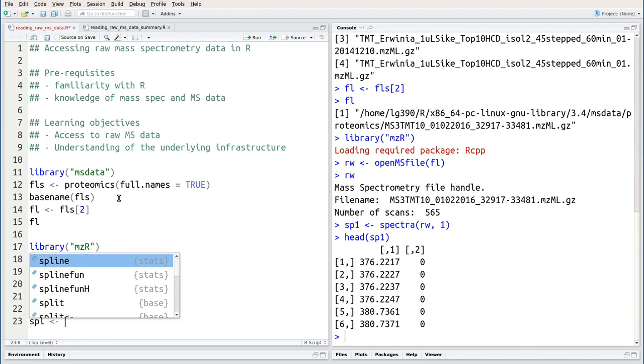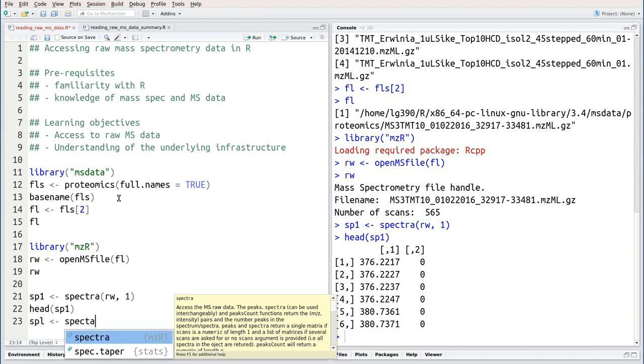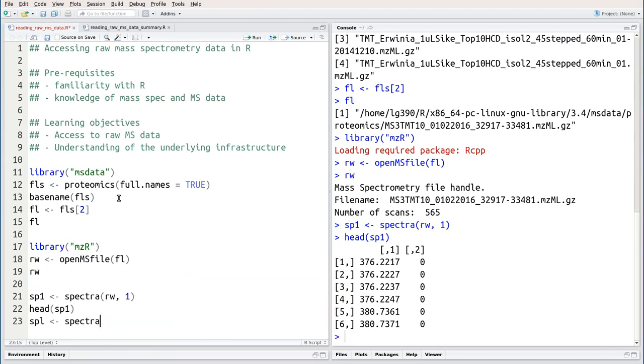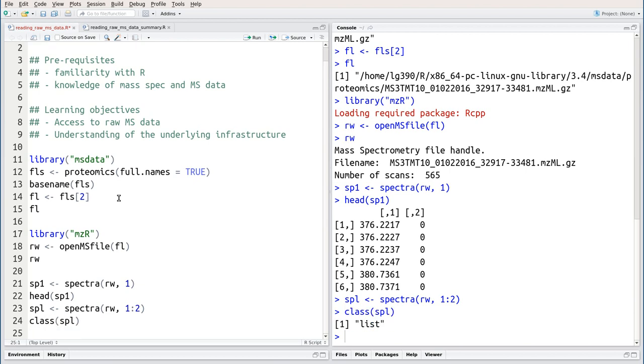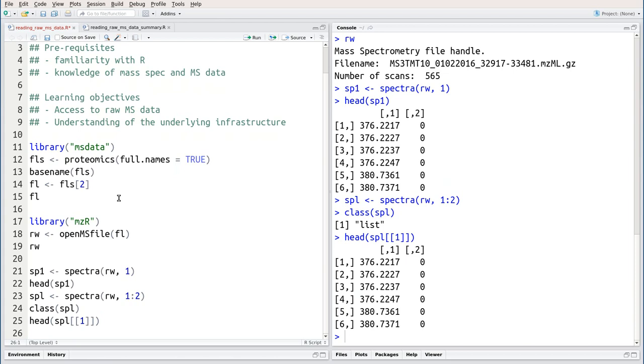If I wanted to access raw data for, say, two spectra, I could use the spectra function and then provide two indices. This spl class is actually a list, a list of matrices as we had before, with the two columns representing the m over z values and the intensities.